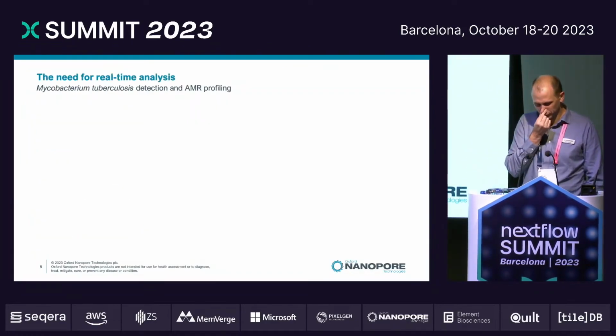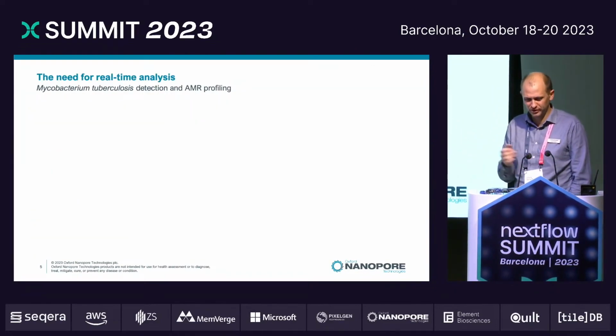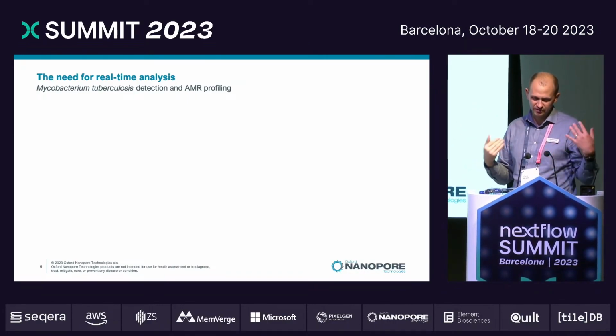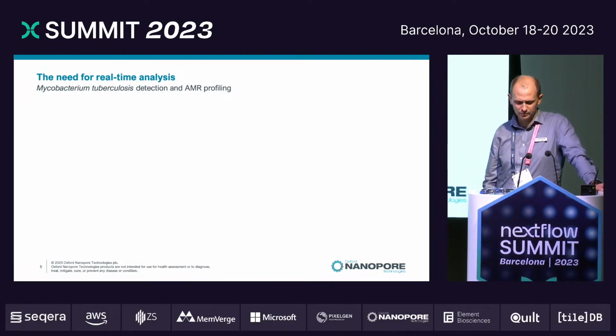So on to the meat of my talk. Why would you do analysis in real time? It's not really the normal sequencing model of collect a sample, send it off for sequencing, get the results back maybe a few weeks later, or maybe quicker if you're lucky enough to have your own sequencer.